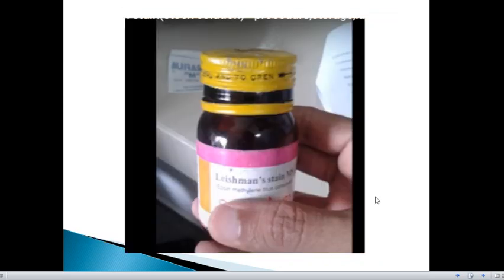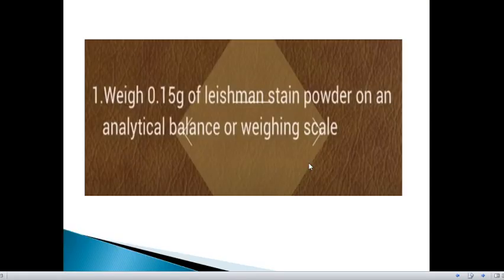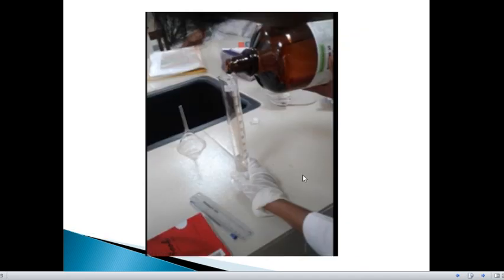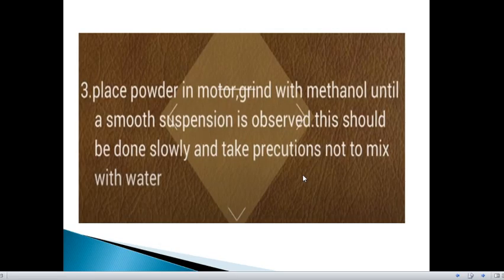Now let's look into the procedure. This is the Leishman stain that you get commercially, in bottle form, and from here we have to make the solution. First, weigh exactly 0.15 g of Leishman stain powder on an analytical balance or weighing scale. Then measure 100 ml of methanol into a measuring cylinder. After that, place the powder in a mortar and grind with methanol until a smooth paste or suspension is observed. This should be done slowly, taking precautions not to mix with water.